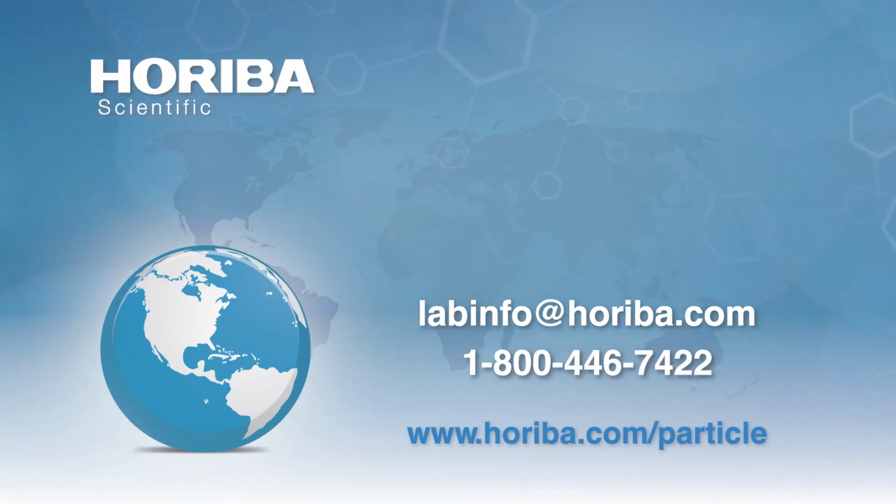That's a great question, and I think the technique of choice so far has been laser diffraction, where, as I mentioned in my presentation, you can use it for aqueous as well as powder form of the sample. So laser diffraction at present is the technique of choice.